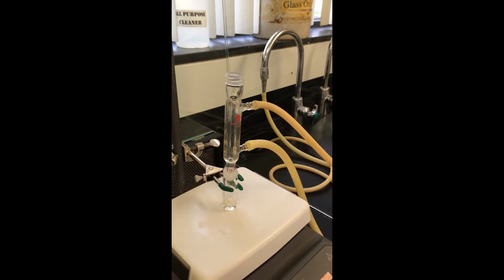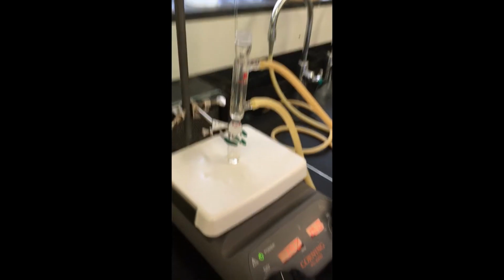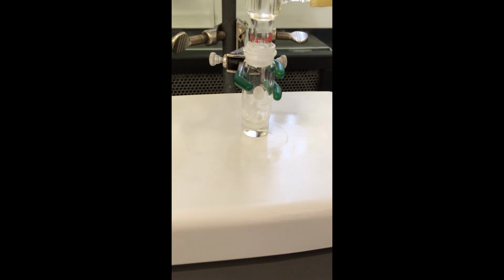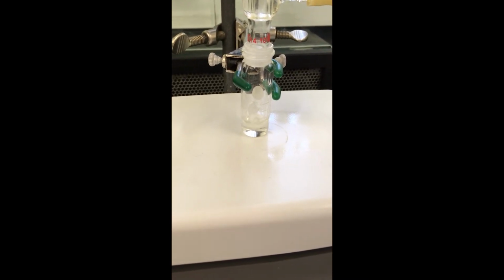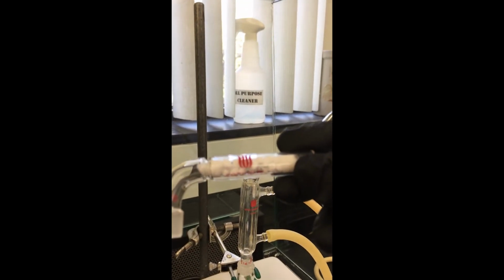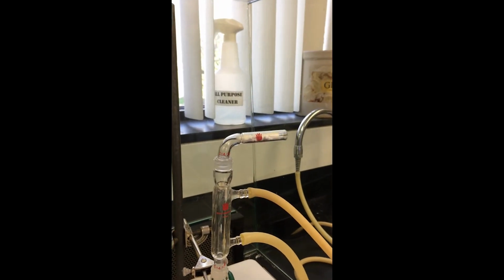And we're going to start stirring our reaction, and we're going to heat this pretty vigorously. So as you can see down there, it's starting to spin, and as it heats up, the crystals are going to dissolve. Okay, so I also have a drying tube here with calcium chloride in it. We're going to stick that on the top to prevent any moisture contamination.